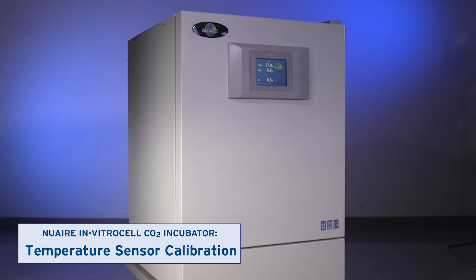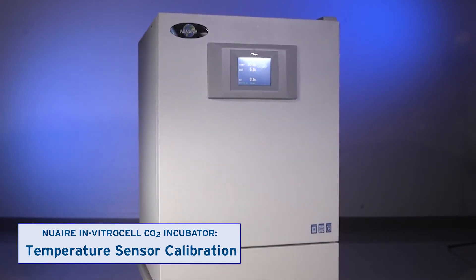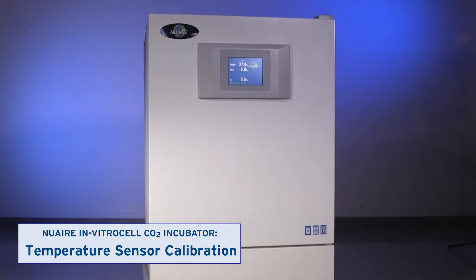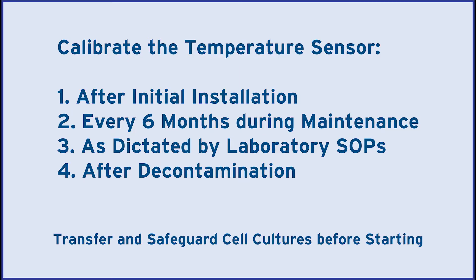This video shows how to calibrate the incubator's temperature sensor. Calibrate it after installing the unit and every six months thereafter, or as dictated by laboratory policy. Transfer and safeguard any cell cultures before starting.